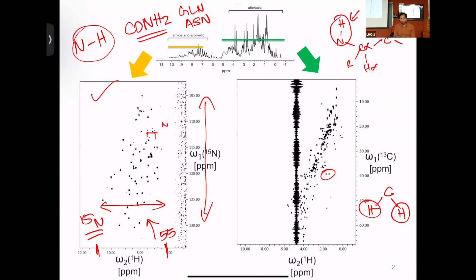If you end up unfolding, the proton chemical shift range reduces drastically, which is once again not surprising. If you unfold the protein, many NHs will be exposed to the solvent, experiencing similar electronic environments, thus the chemical shift dispersion reduces. So slowly we are able to understand that chemical shift is a wonderful reporter of tertiary structure, and therefore if we are able to characterize it, we'll be able to study the biomolecular systems, right?